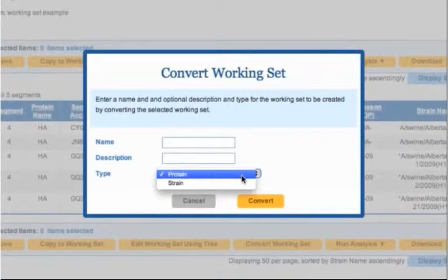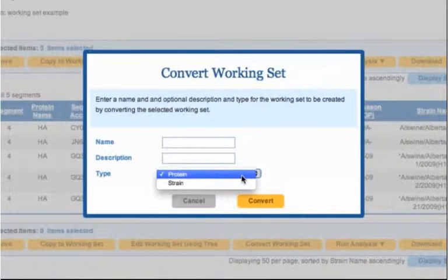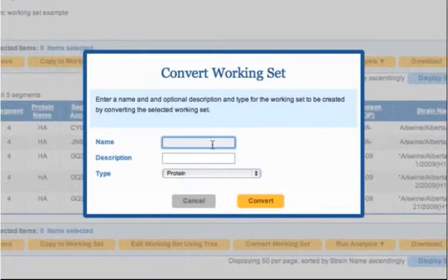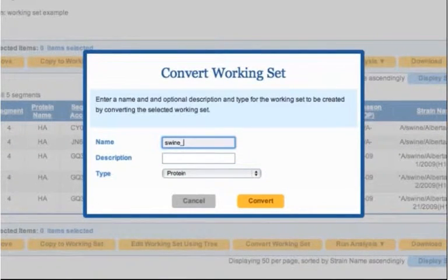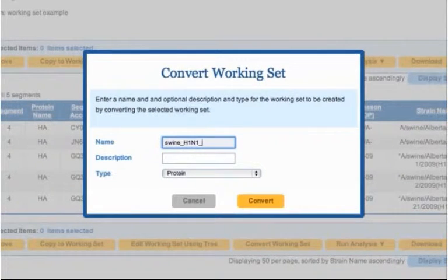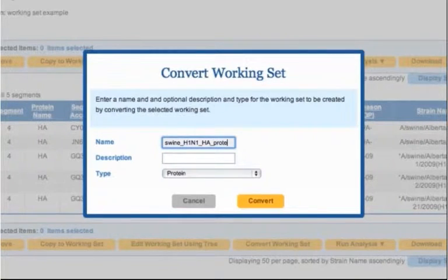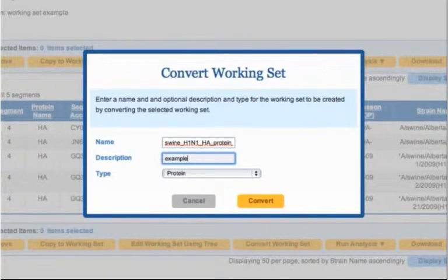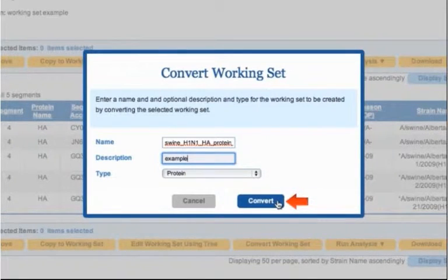Click the Type drop-down menu to view the available data type options. For this example, we'll convert the nucleotide sequence working set to a set of protein sequences. Enter a name and description for the new working set, then click the Convert button to complete the process.